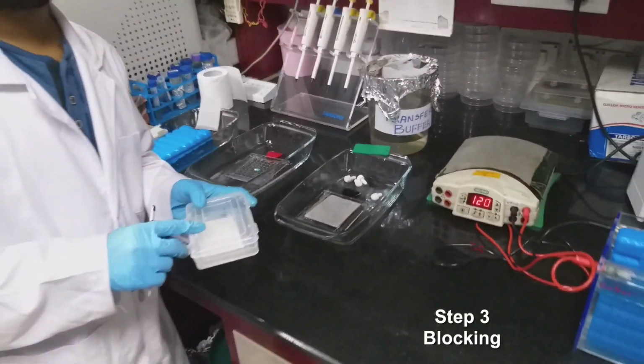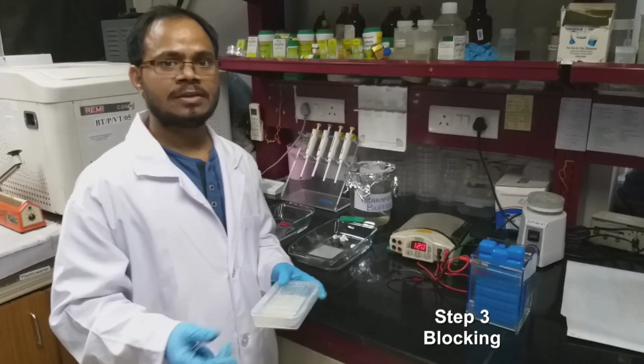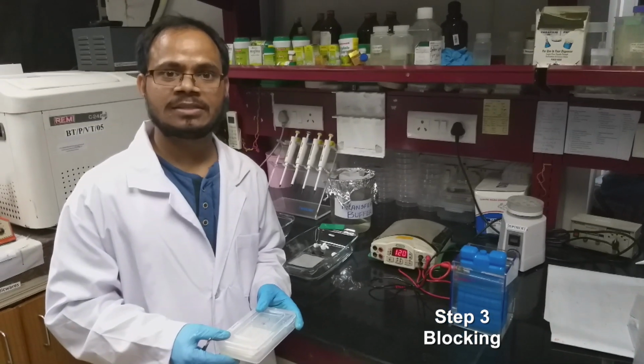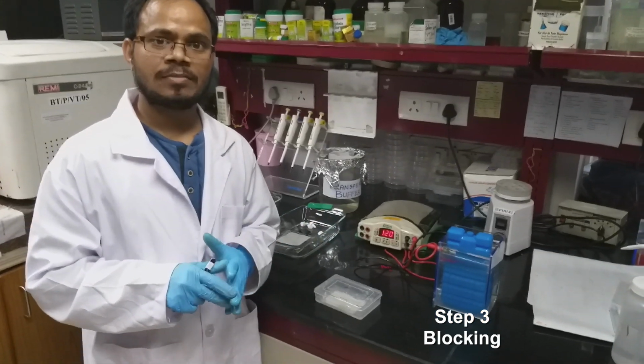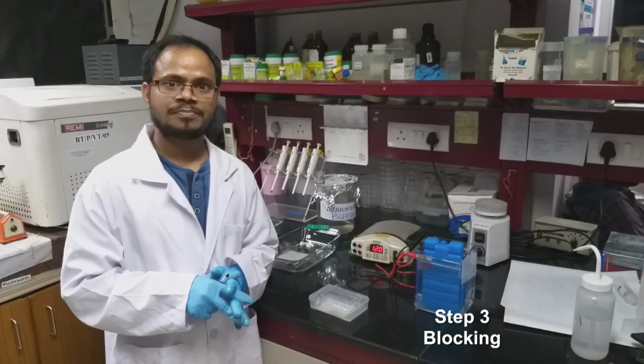In this condition, if you are keeping it at room temperature, it is for at least 2 hours. If you are keeping it at 4 degrees Celsius, you can keep it overnight. The blocking buffer contains skim milk or BSA along with Tween 20.